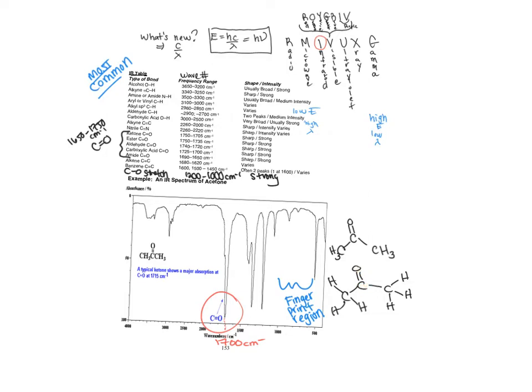So that matches what we predict for acetone. Now let's look at our other bonds. We have a CC bond and we have a CH bond. Let's look for the CC bond. OH, CH, NH, CH, CH, CH, OH, CC. But this is triple bond C. This is CC double bond C. These are all COs, CN. So there's no single CC bond, and that's because there is no frequency absorbed for those bonds. So we don't see it.